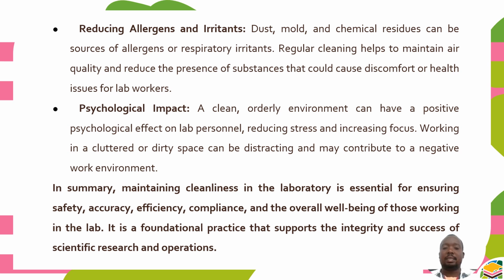Psychological impact: a clean, orderly environment can have a positive psychological effect on lab personnel, reducing stress and increasing focus. Working in a cluttered or dirty space can be distracting and may contribute to a negative work environment.